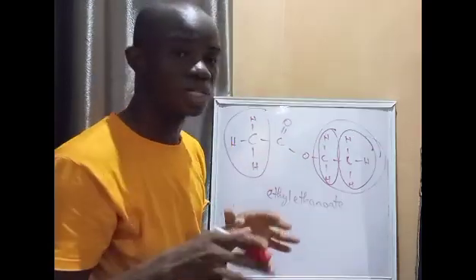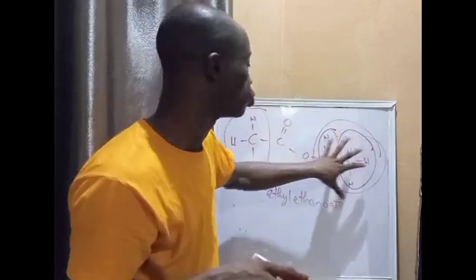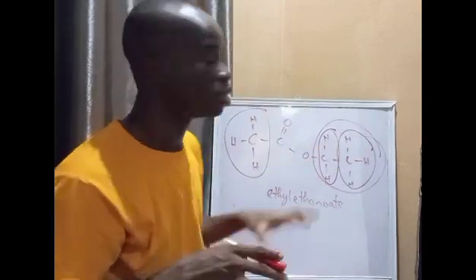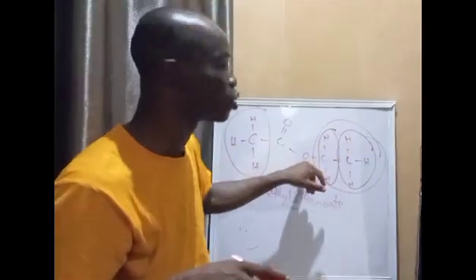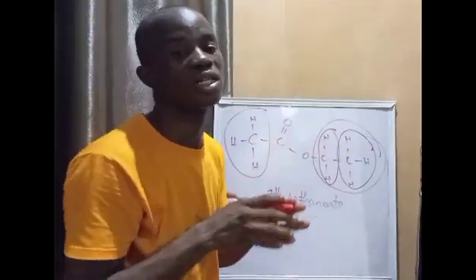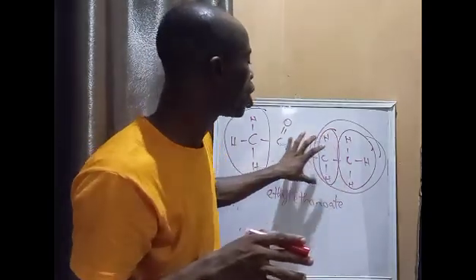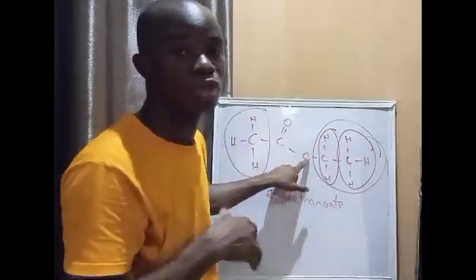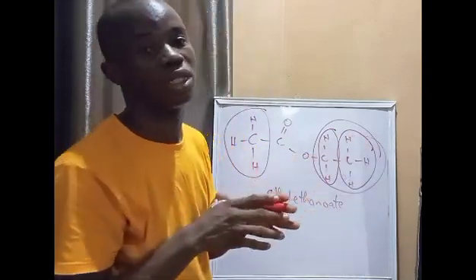But the first thing I said was that the CH3 we have here and this ethyl functional group are attached to different things. This CH3 is attached to carbonyl, while this ethyl is attached to an oxygen. So that already indicates that they are in different chemical environments. But at the same time, the CH2 is much closer to oxygen compared to this CH3. That also means that they are in different environments.